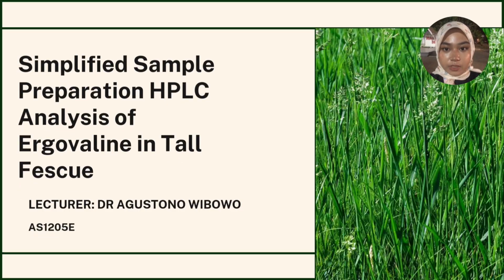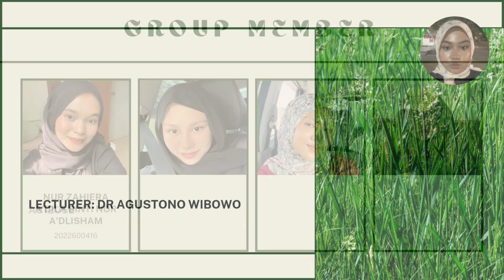Our topic is about simplified sample preparation for HPLC analysis of ergovaline in fescue.